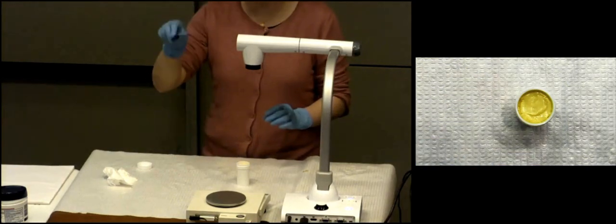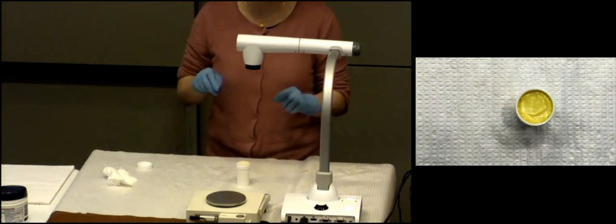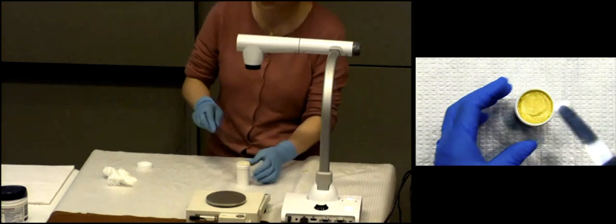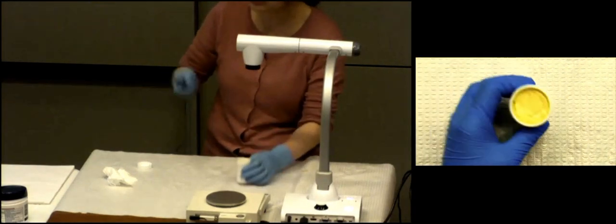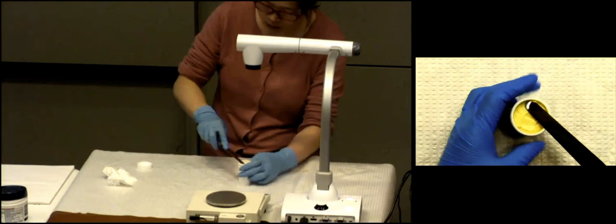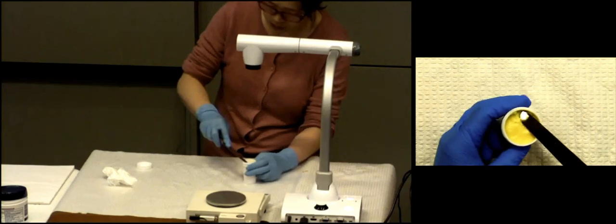So your spatula, use your small spatula and go in at a certain degree. How much of an angle are we talking about? It really depends on how much ointment or cream you have and how close it is to the top of your jar. For me, maybe I need about 45 degrees. All right, your non-dominant hand is holding the bottle, your dominant hand holding the spatula. Okay, so watch me. I use my dominant hand holding the spatula, my non-dominant hand holding the bottle, and turn at the same time.